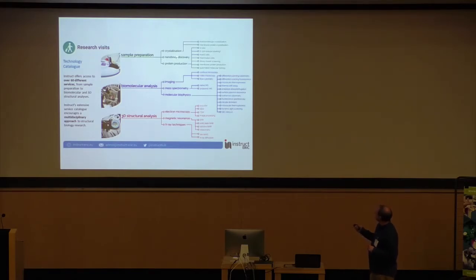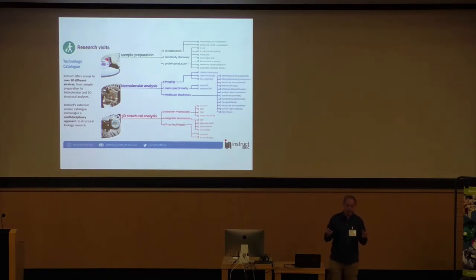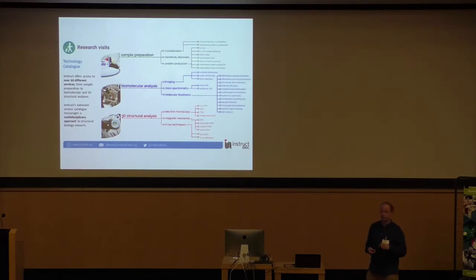Then crystallization is very often also something that is difficult, a bottleneck by itself. That's why the field is also moving a lot towards CryoEM. And nanobody discovery can actually help in that for crystallization, but also for imaging. We had a seminar from Anna Roussel, who is here today, yesterday.